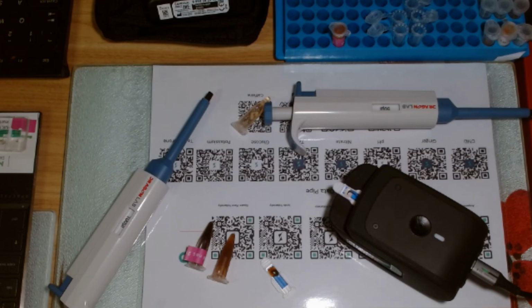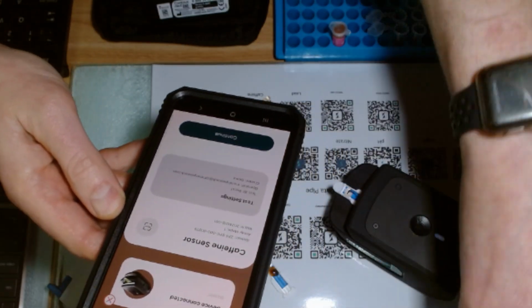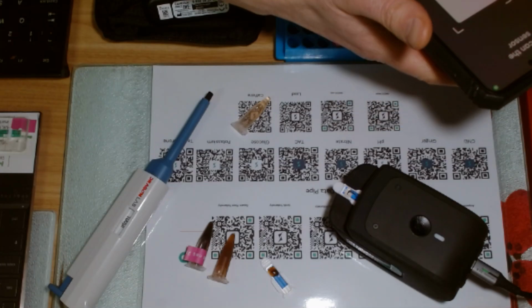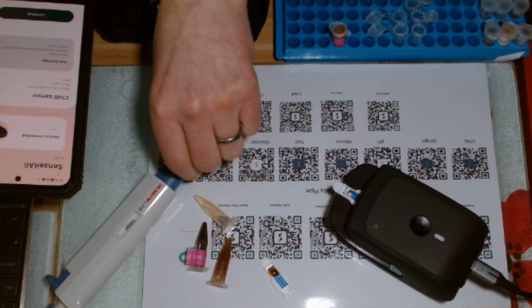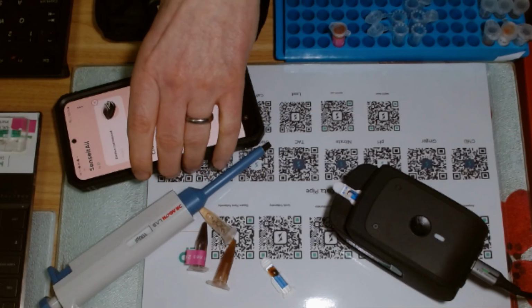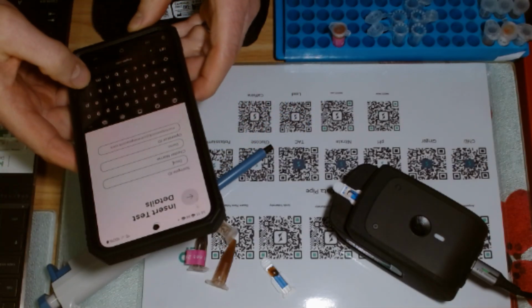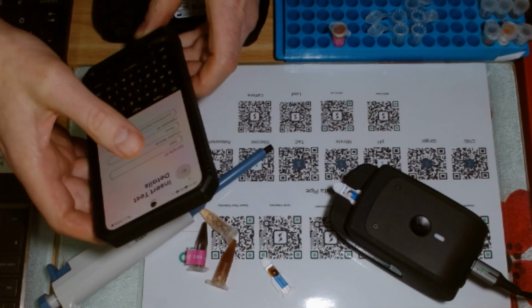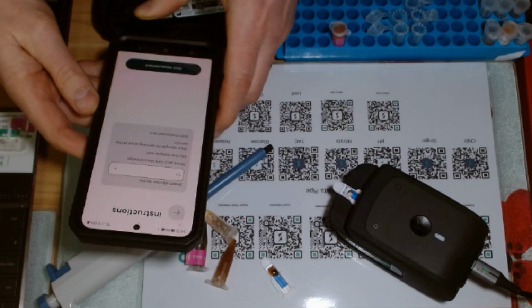I should have really run that sample effectively. So at the moment, my app is in its caffeine mode. So I need to go into chili mode, which I have now done. I am connected to the device. I do have a chili sample on there. I might just give this a quick name, which will be tab. I'll just call it tab 3. It's just something I can find in a minute, and then I'm essentially off.